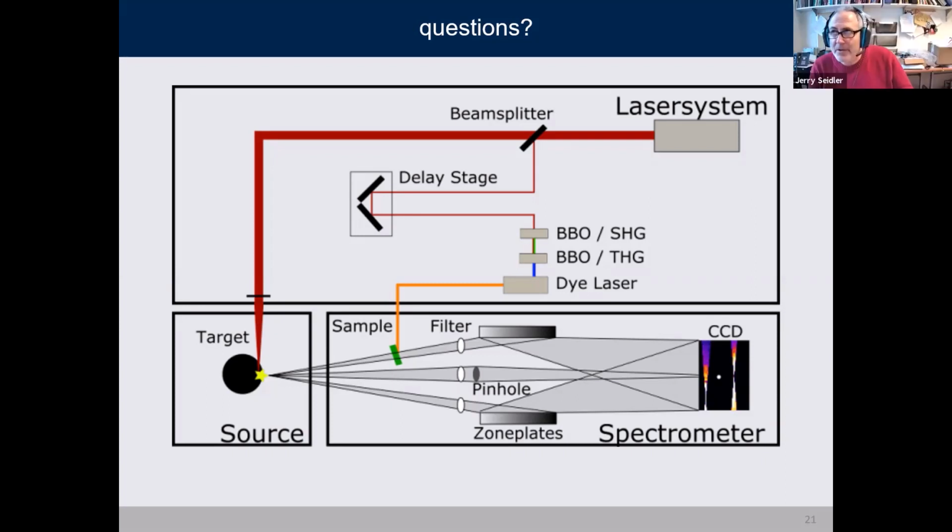Got it. I understand. There's a question. What can you tell us about your liquid cell effort? We're totally in the middle. We have a very promising cell. This is I think also done in a few other cells using helium atmosphere to prevent the bulging of the windows. We hoped that a passive pressure equalization system would work, but we're still optimizing the design of the spacer, because you always have to have some sort of spacer between the two windows. Right. And yeah, we're very in the middle.